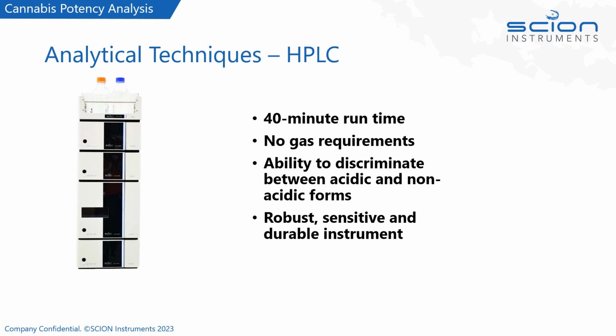And finally, we have SCION's LC. So this is the LC 6000. This particular method was a 40-minute runtime, so quite a bit longer than the GC. Obviously, we have no gas requirements, so there's no need to store high-pressure gases, helium and hydrogen.